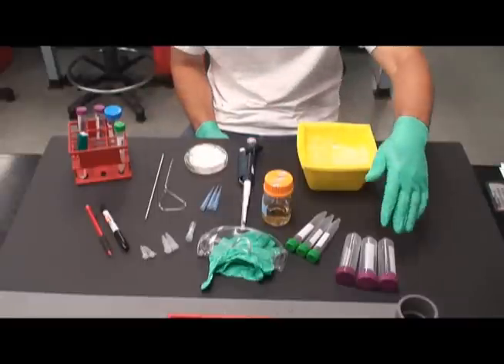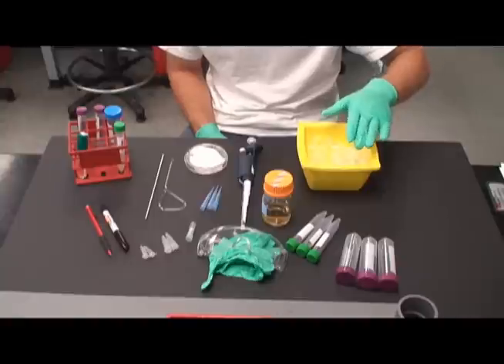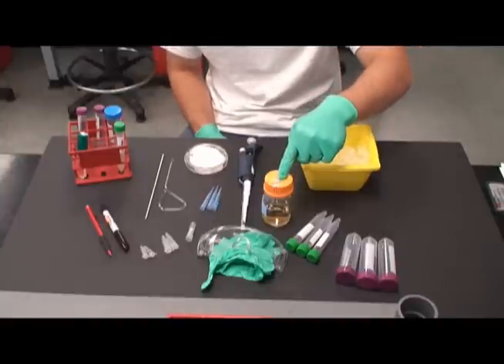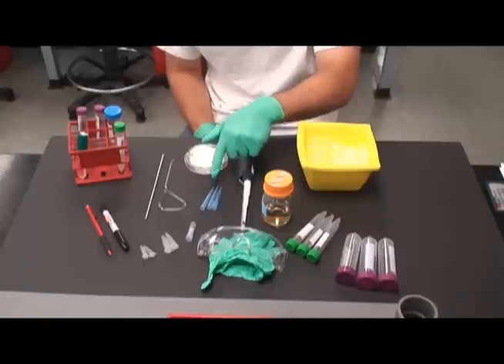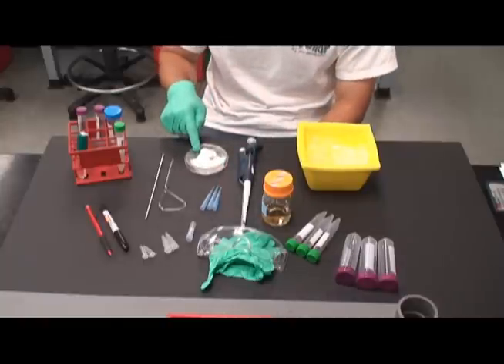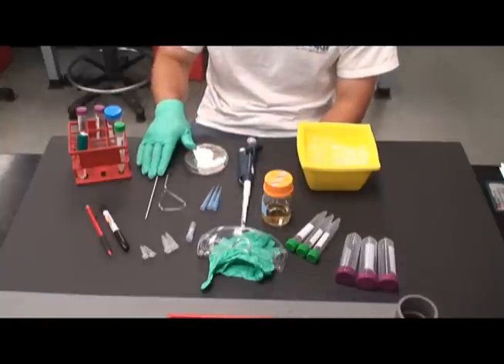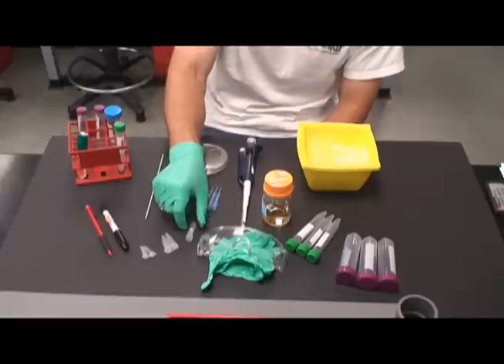You need test tubes, a bucket of ice, LB broth, micropipetter and tips, special LB and antibiotic plates, glass spreading rod and wire inoculating loop, QIA columns.